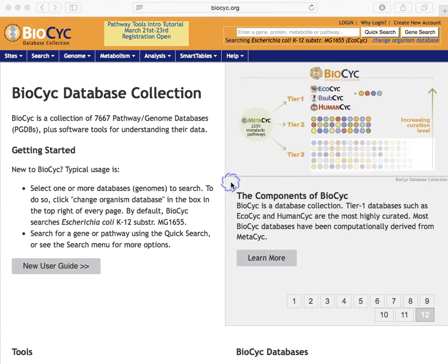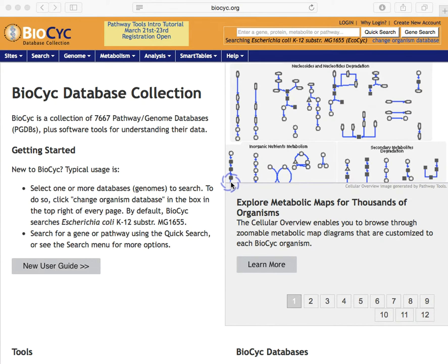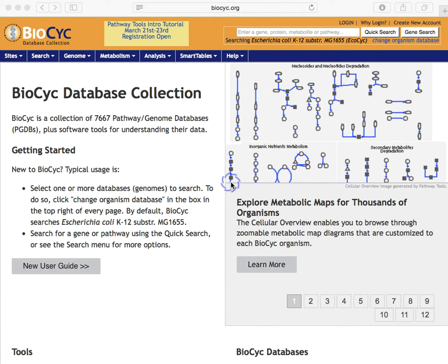This webinar will cover gene and genome aspects of BioCyc, including the gene page, operon page, genome browser, retrieving sequence information, and performing sequence searches.